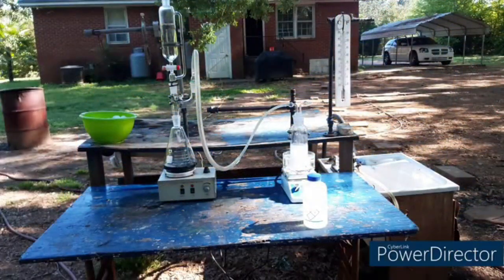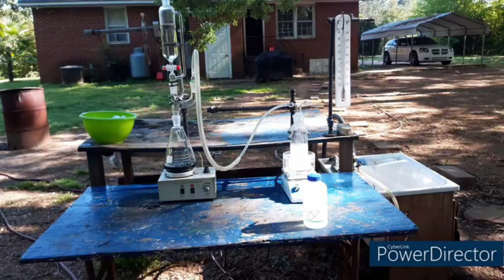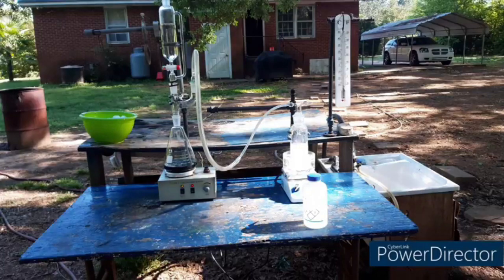Okay, we have our standard setup here for generating hydrogen sulfide. On the left in the addition funnel, there's about 200–250 mL of sulfuric acid that's roughly 8 molar. In the actual flask there is ferrous sulfide plus all the liquid left over from where I made the potassium sulfide — basically the filtrate from crystallizing the potassium sulfide. I've started saving that kind of stuff to toss into the hydrogen sulfide generator. It tends to give pretty good results.